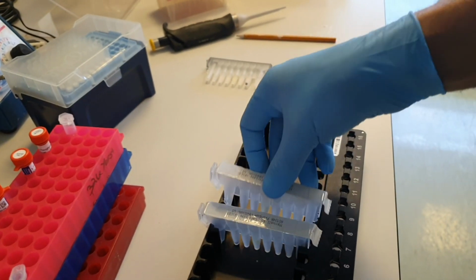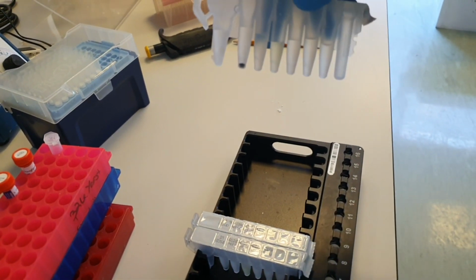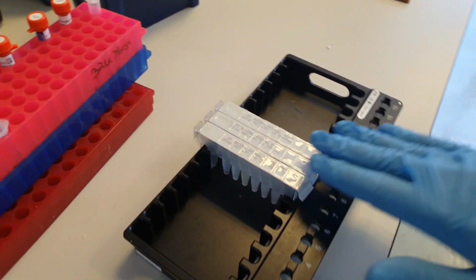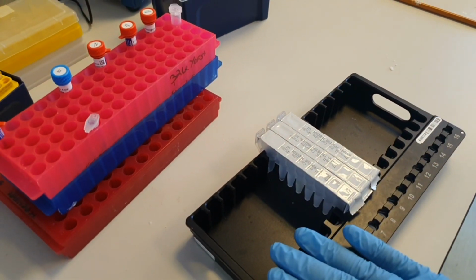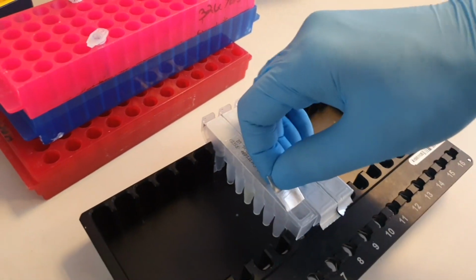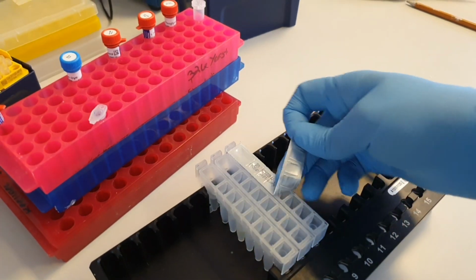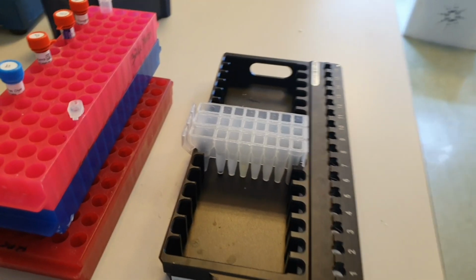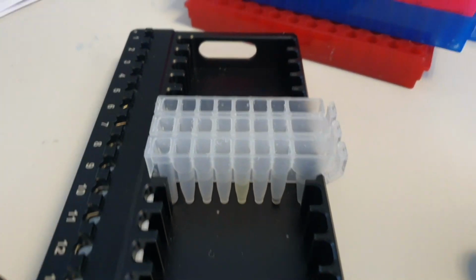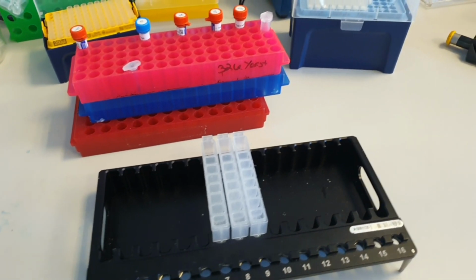Similarly, we take the next one, push it down, and the next one. It's good to use the middle of the rack instead of putting them on either side. Next we will peel off the seal. Okay, so here we have our cartridges in place. The important thing is to make sure they're in the right orientation. Next we need to place a plunger.